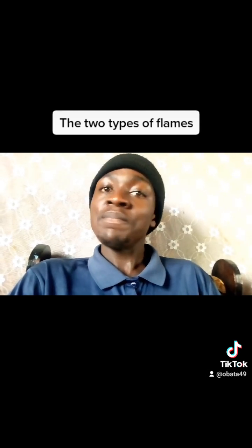But I saw a question in last year's KCSE exam whereby they were asking students to describe how a substance can be heated in the laboratory. I really don't remember the compound or the substance that was being heated. Basically they are talking about how you light the Bunsen burner, how you adjust it to a non-luminous flame, then you carry out the other procedure like that.